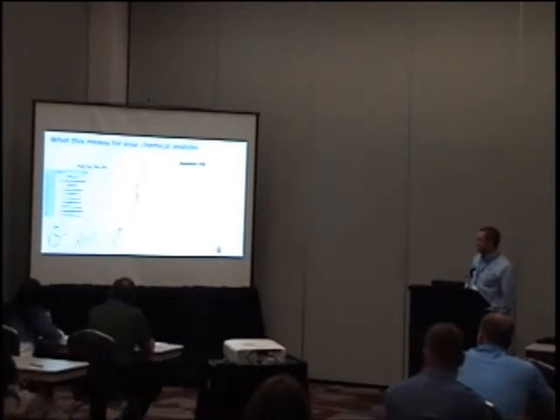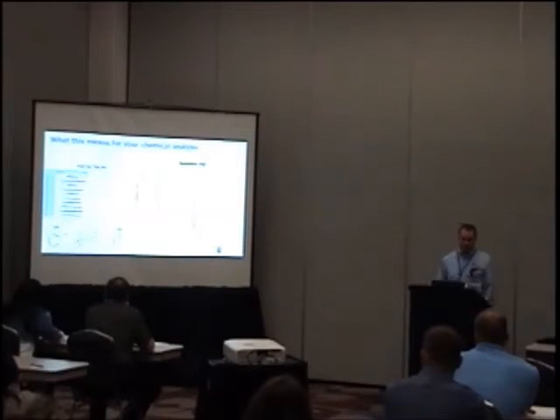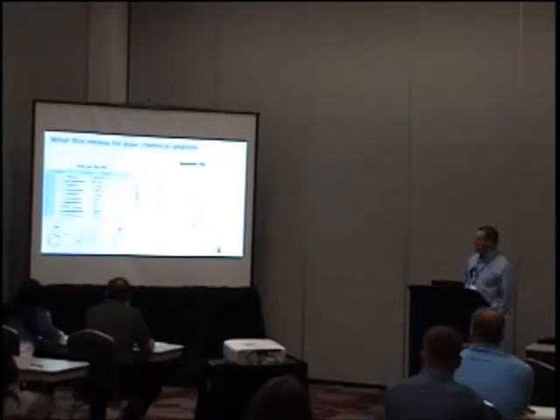So we can look at a standard FID signal, and we see on a DB5 or 5% phenyl column, we get separation in this mixture, and we know the order of elution because it's a boiling point column, and we've seen this test done before. From the chromatogram here, we can get the peak areas, but we don't, of course, know how to relate these peak areas to concentration since this is just a standard FID signal. We need to know the response factors. So what do we all do in this situation? We do calibration curves. 5-point calibration curve.